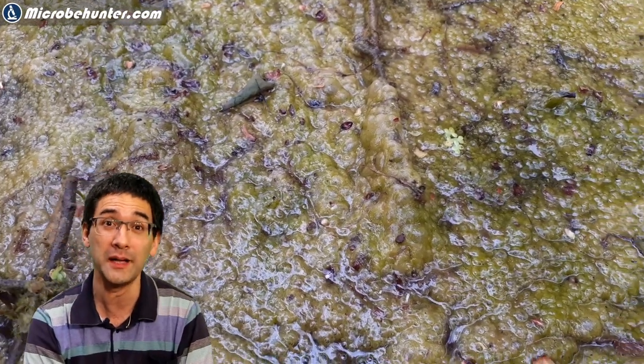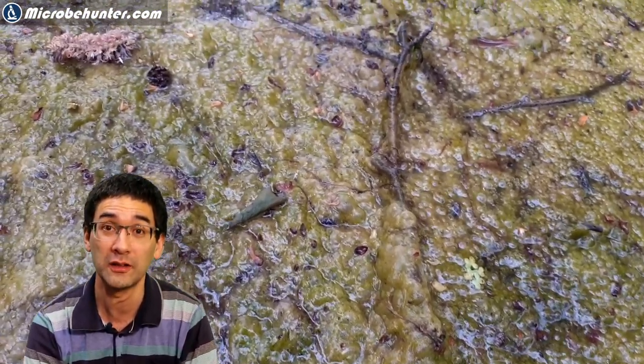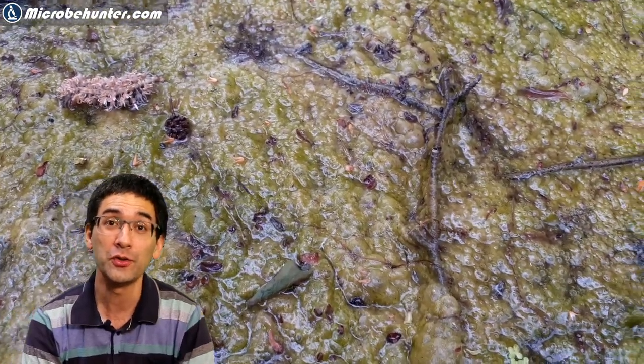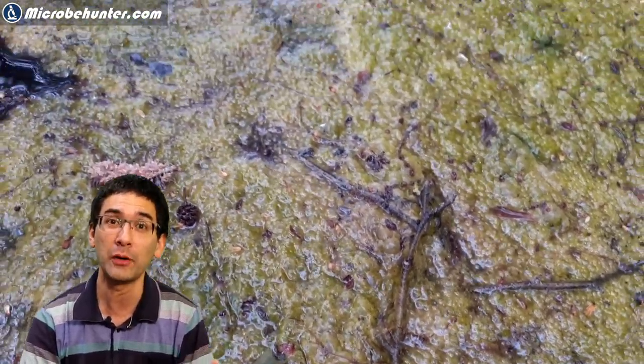I decided to take some of this stuff along and have a closer look at home. Usually, these natural sources have quite high biodiversity, so you won't only find mosquito larvae.